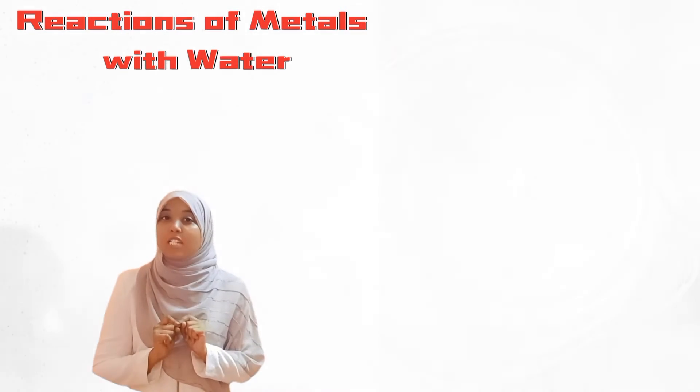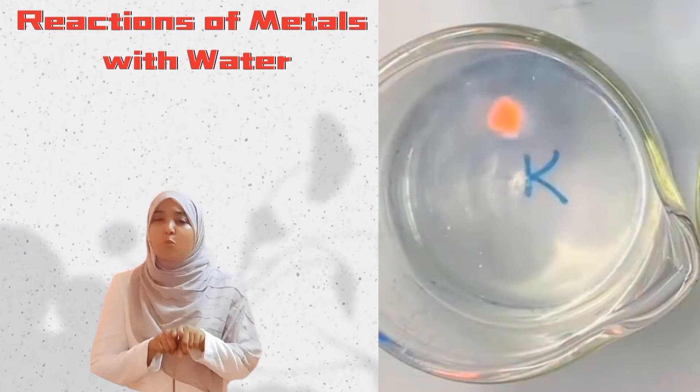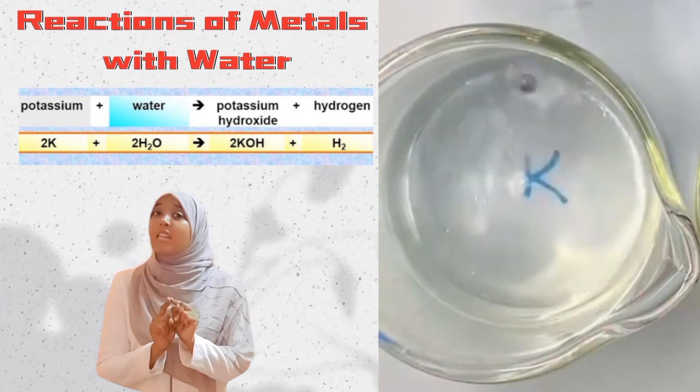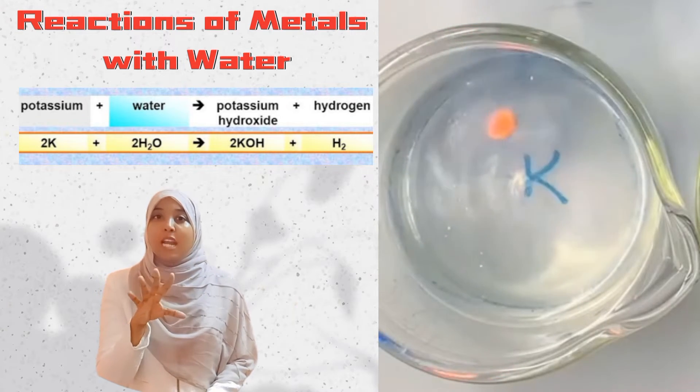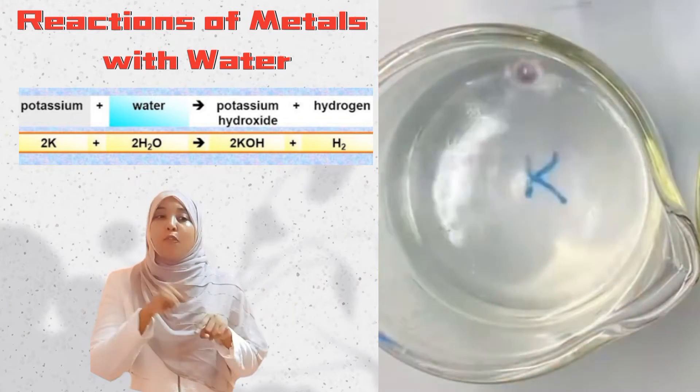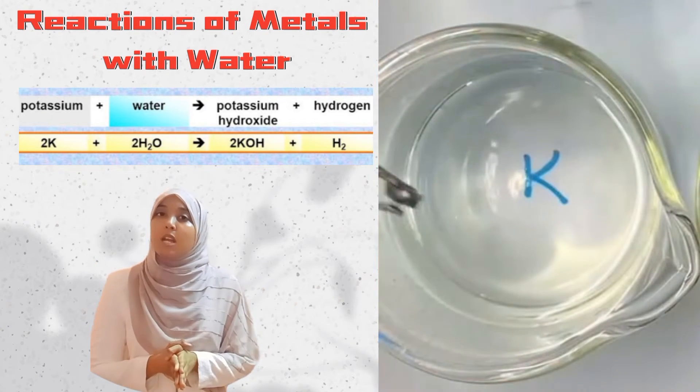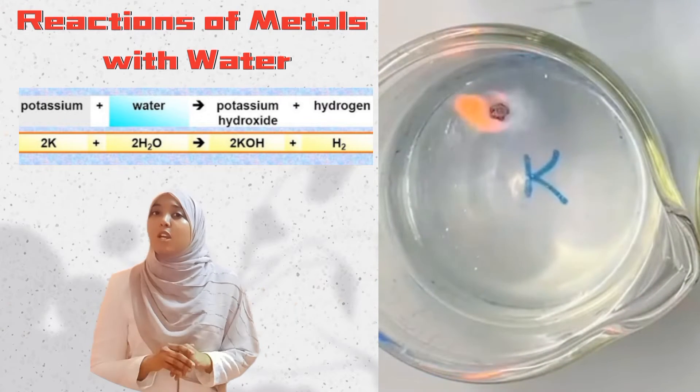Moving on to potassium. Being more reactive than sodium, the reaction is going to be explosive. That's why this is usually not carried out in the lab. As you can see—look at that! Potassium forms a silvery ball which floats on the surface, similar to sodium, but there's an extra piece: the formation of a flame. You have a lilac or light purple flame.